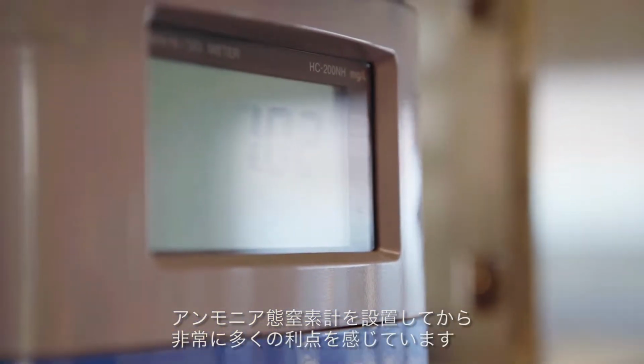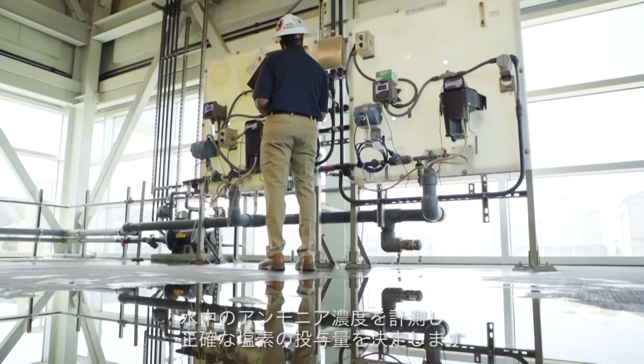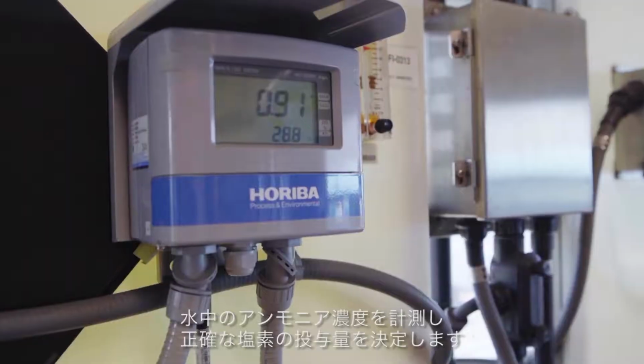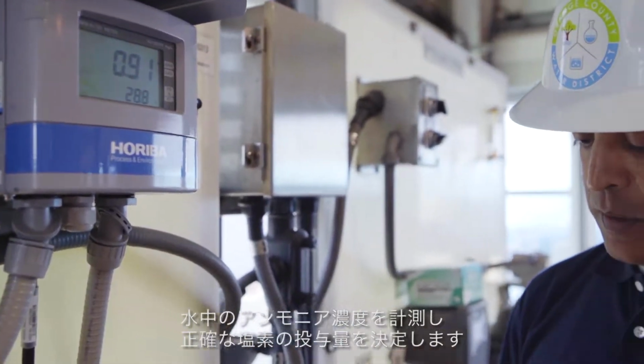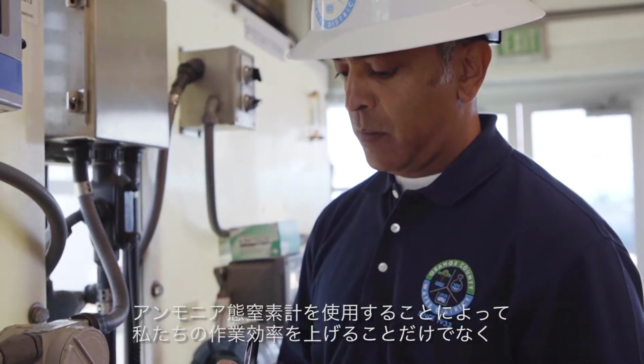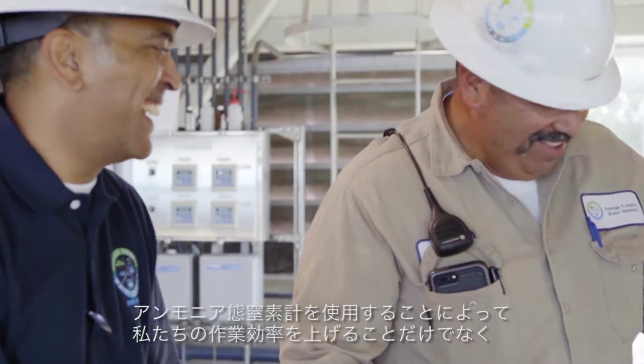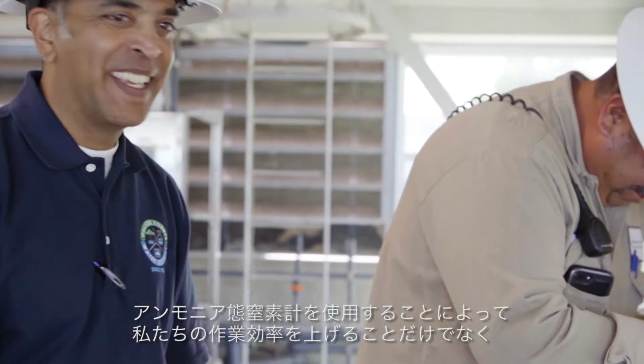So there's a great benefit to us to have ammonia nitrogen or ammonia monitoring with the online ammonia analyzer. What it allows us to do is to determine the background level of ammonia, and that helps us to more accurately dose our sodium hypochlorite or our chlorine to maintain our target chloramine residual. By having the ammonia analyzer and being able to target exactly how much chlorine to add, not only does it make our process run better, but it efficiently allows us to use chlorine.